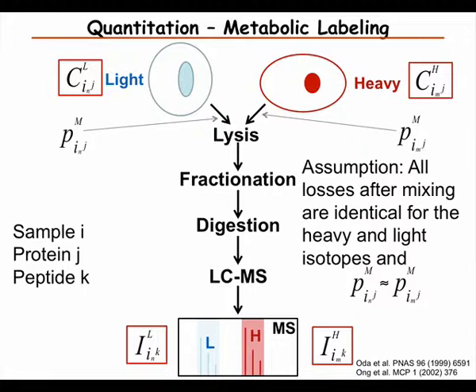So that's definitely advisable to do, because there could always be some strange effects, and especially from contaminants. If you get contaminants, they will be light. So that's why you can sort those out by doing the reciprocal experiment, because they will not have consistent ratios when you switch.